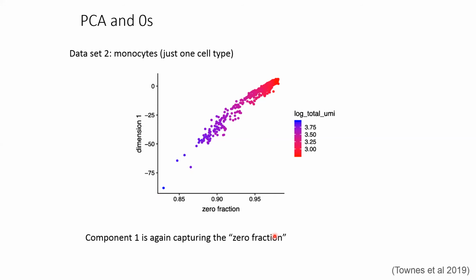And again, to test this idea, we can try to generate more orthogonally annotated data sets where the physiological state or a phenotype of interest is known before sequencing. And then you can try to map which set of genes best represents differences in the physiology of your cells. And there are a few studies which try to consider this. The Towns paper is one of them, but it's a tricky problem and there are not very many annotated data sets available. And this is a major hurdle for progress in the field.